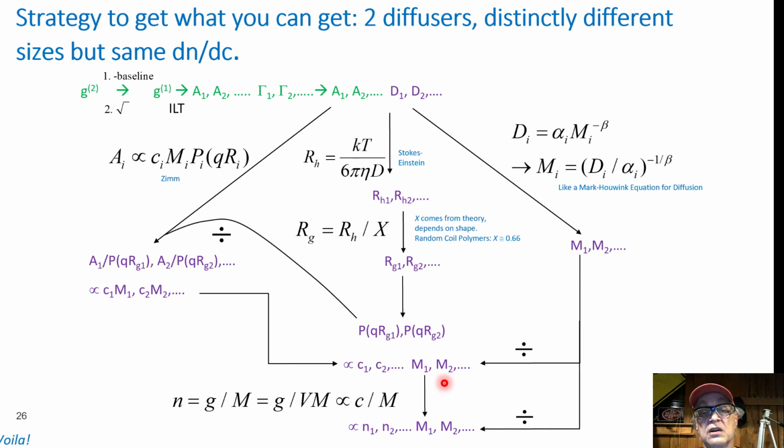So it's a very messy situation. You would not do this unless you had to. But lots of times you kind of have to. I'll give you a case where it's really useful to do this. Suppose it's your job to figure out the molecular weight distribution of Teflon. Well, you're too late because the guy already did that. He did it by dynamic light scattering because nobody wanted to put Teflon into the gel permeation chromatography instrument. So this is the kind of case that can happen.